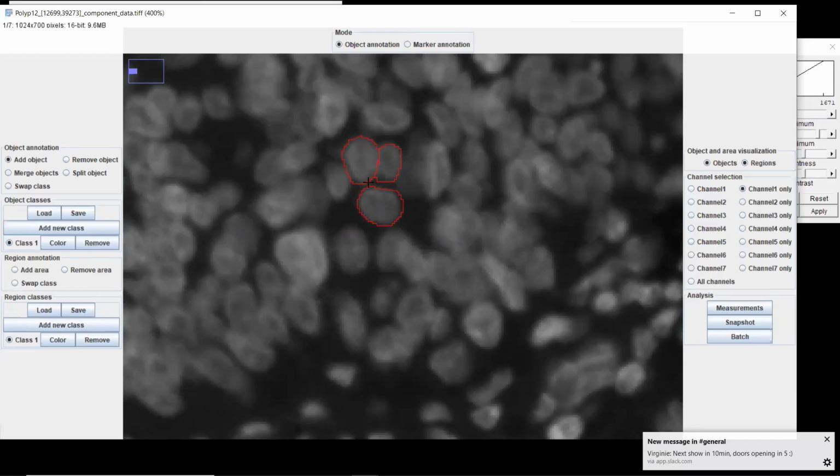The other thing is that as one pixel cannot belong to two objects, if you go on top of a previous object like this, then it's going to just include everything that is not overlapping with the previous object. When I started designing this plugin, that was really for that, to do something that would go a bit faster than what I had before.